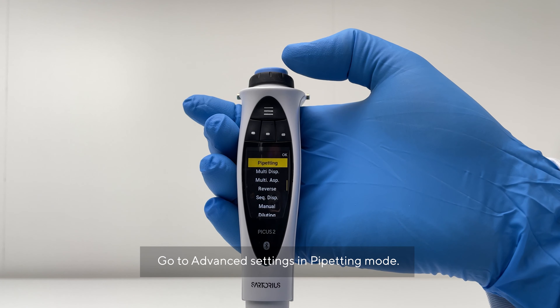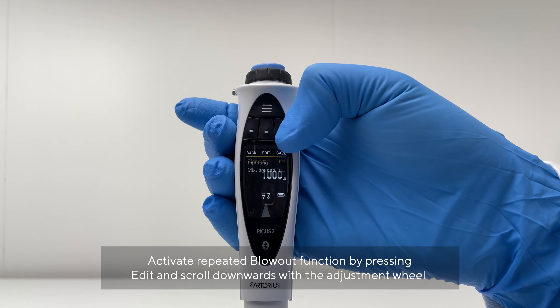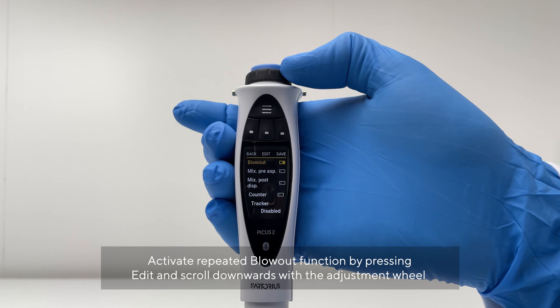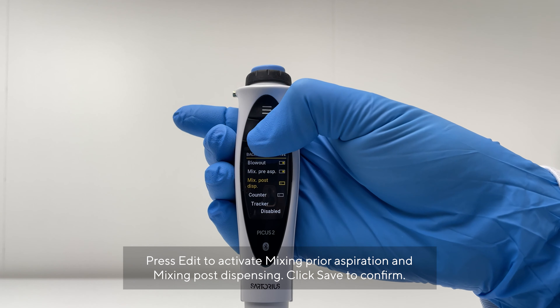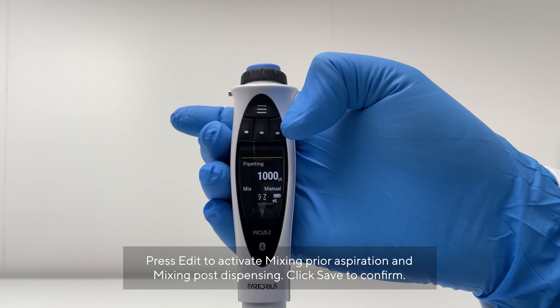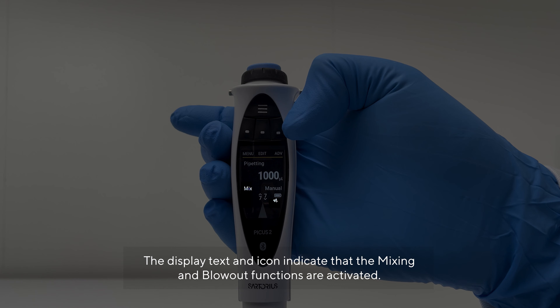Go to Advanced Settings in pipetting mode. Activate the repeated blowout function by pressing Edit and scrolling down with the adjustment wheel. Press Edit to activate Mixing pre-aspiration and Mixing post-dispensing. Click Save to confirm. The display text and icon indicate that the mixing and blowout functions are now activated.